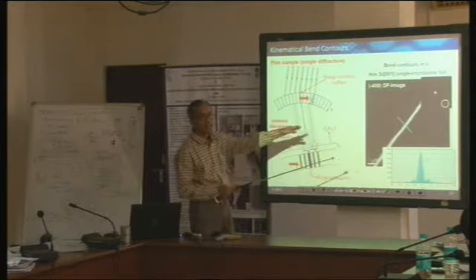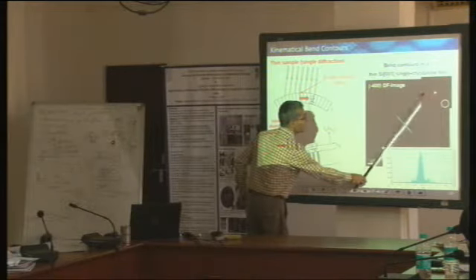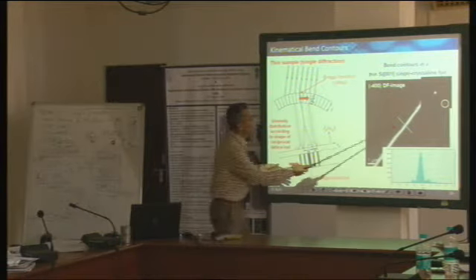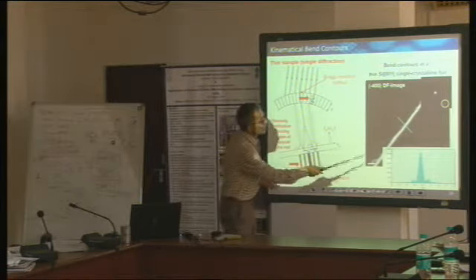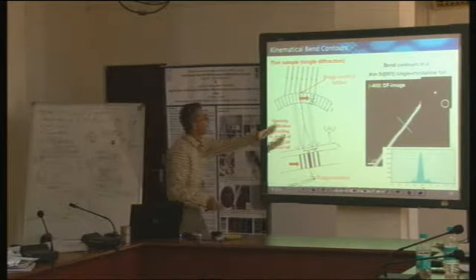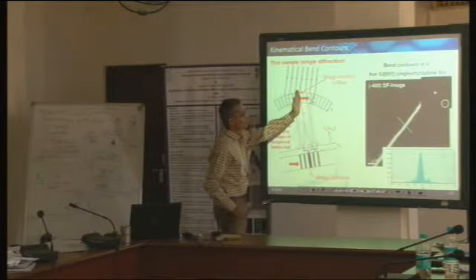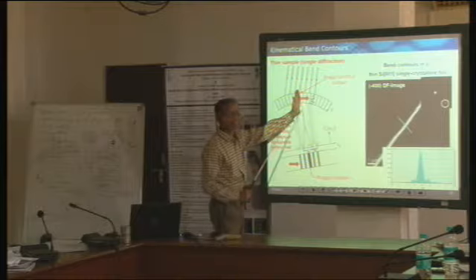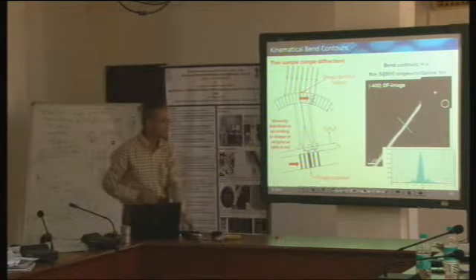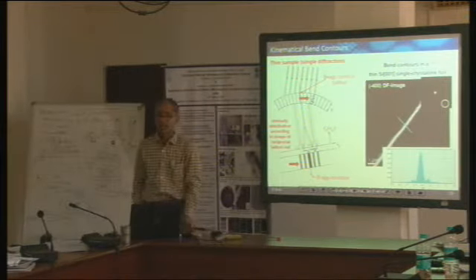Now what we can say from this image is that this particular area along this line is where S is equal to 0, and as I go away from this to this side and to this side, I keep going away from the Bragg diffraction condition, as is schematically displayed here. Along this line, I have the Bragg diffraction condition exactly satisfied. As I go away, I am going further and further from it. But I am at least able to make some sense.